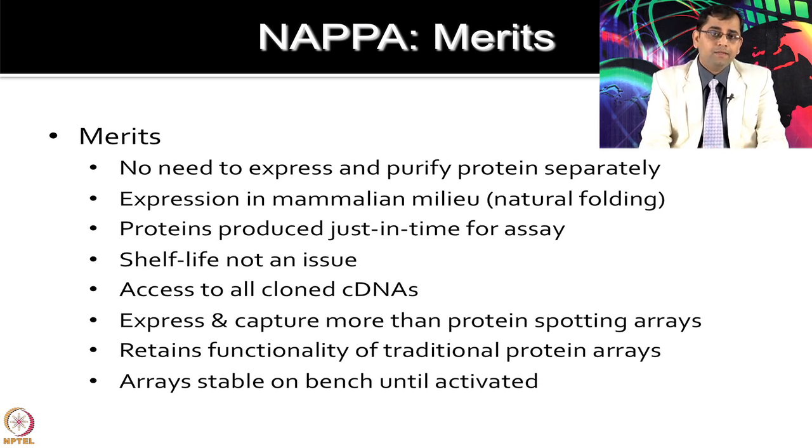Ideally, any cDNA clone which you have access to, you can print on the chip and utilize to make the array for the NAPPA based chemistry. Expression and capture in this case is much more than if you had to just print the purified protein, which will of course be in a very, very small volume of nanoliters, as compared to the protein produced on the chip itself, fresh, the day when you are doing the expression.